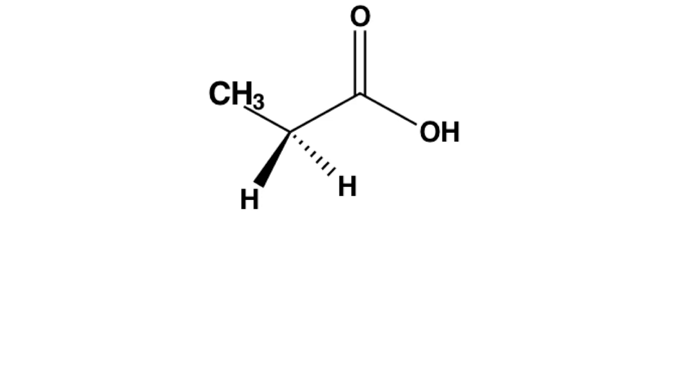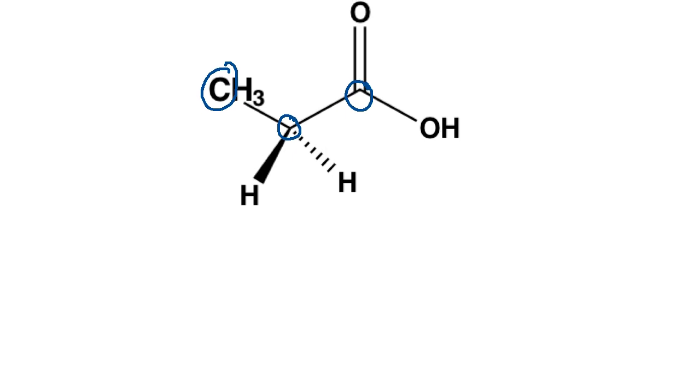But let's take a look here. So the carbons, I've got a carbon here with the CH3. There's another carbon here for the CH2. And there's another carbon right here for the carbonyl on the carboxylic acid group. So for this compound, as far as the carbon NMR is concerned, I would expect 3 signals.